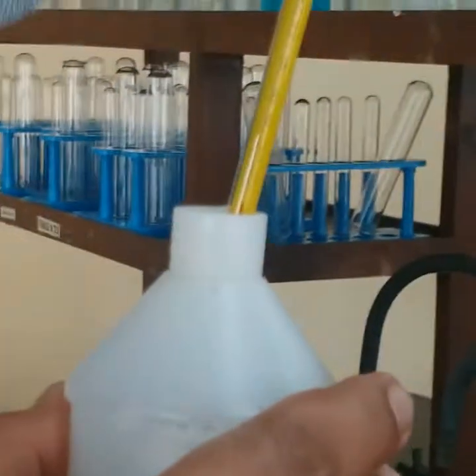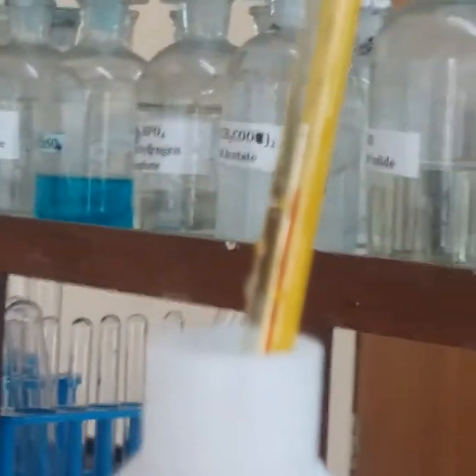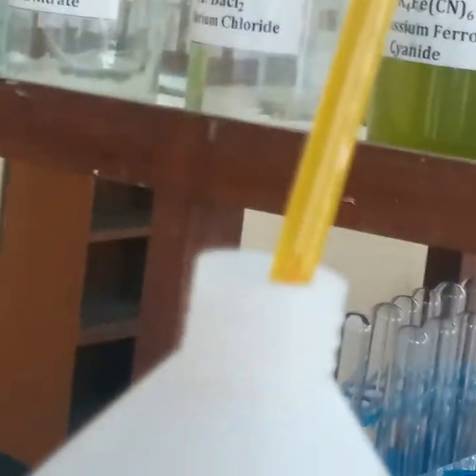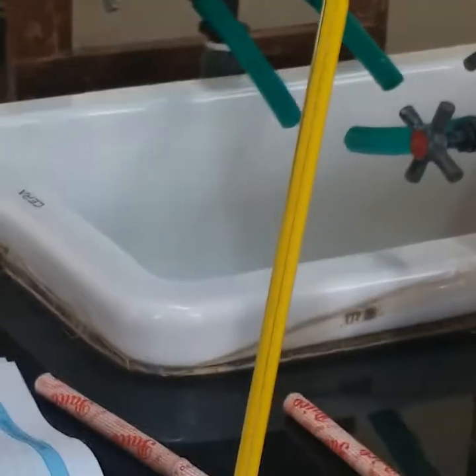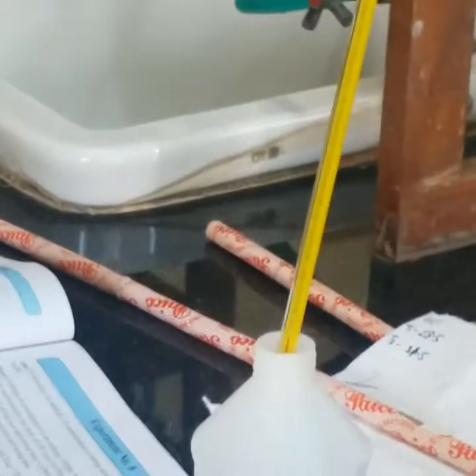We can see the temperature. It is 29.5°C. This is T1 — the initial temperature of the HCl. You can see the red mark reading at 29.5°C.